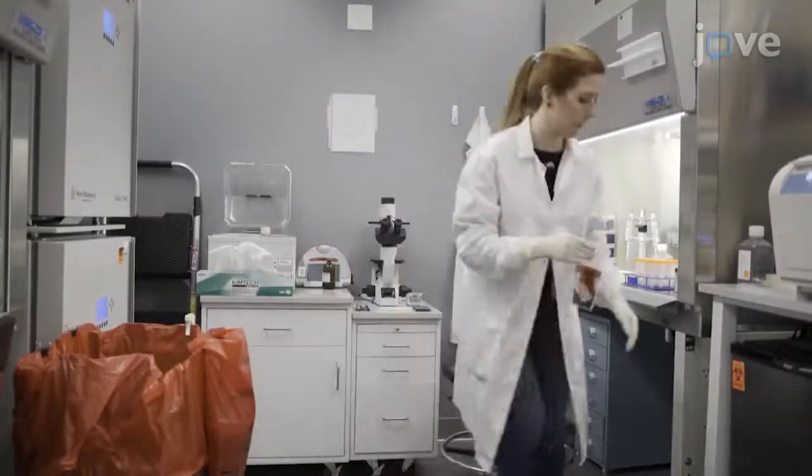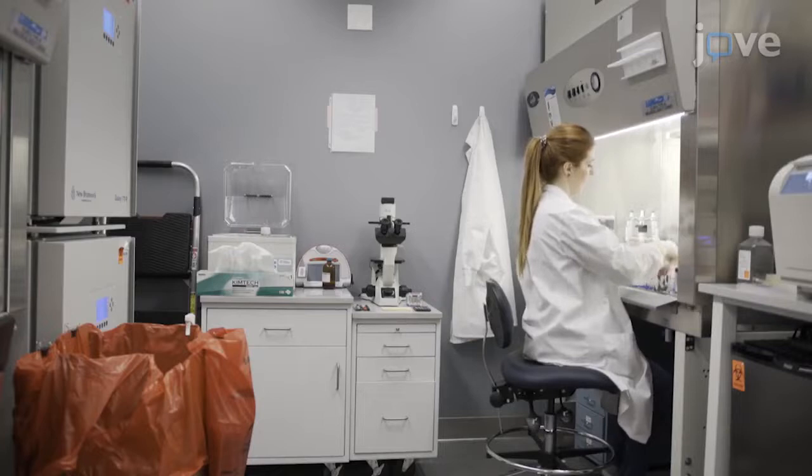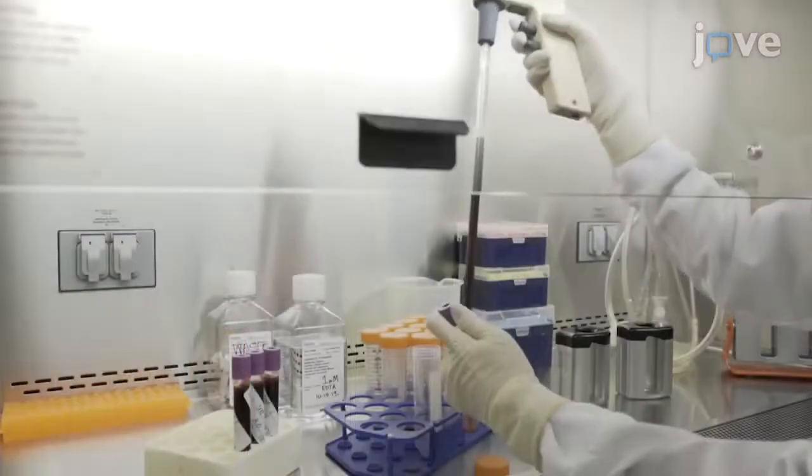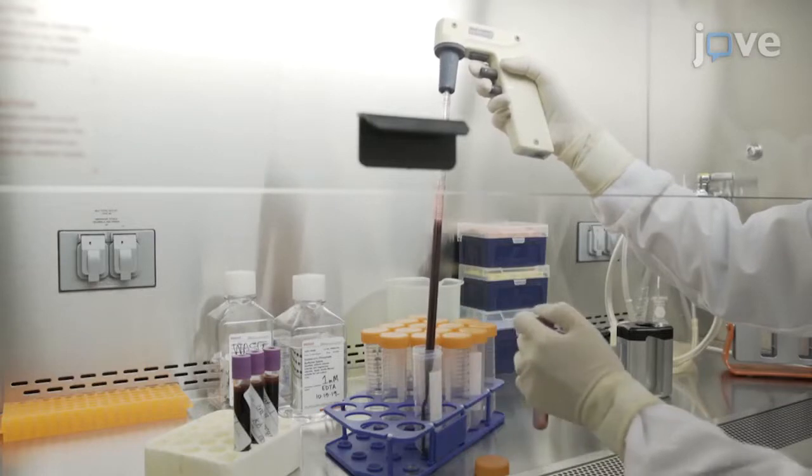After collecting 40 mL of fresh human whole blood in four 10 mL EDTA vacuum tubes, use sterile technique to transfer all of the blood into a single 50 mL conical propylene tube in a biosafety cabinet.